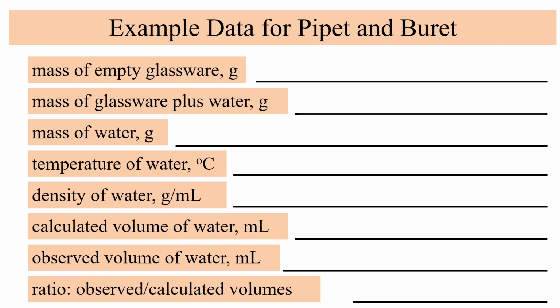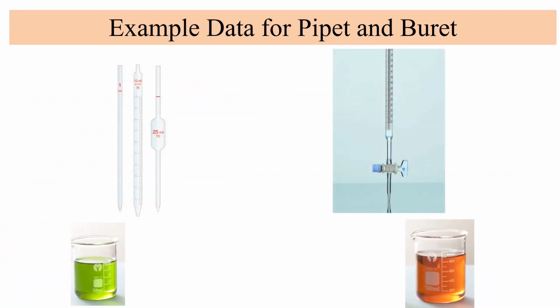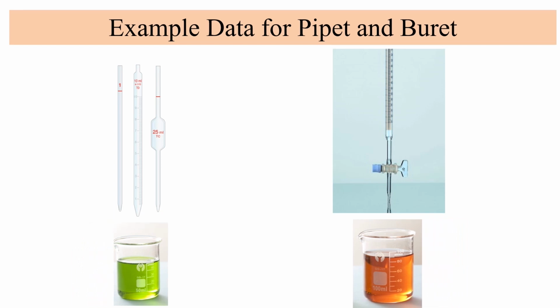For the pipet and buret part of this lab, we have to make a subtle change. You see, we can't place the pipet or buret on the balance to get their mass. Pipets and burets are delivery glassware and very narrow. We'll need to deliver an observed volume to a weighed beaker, then continue with finding the calculated volume.